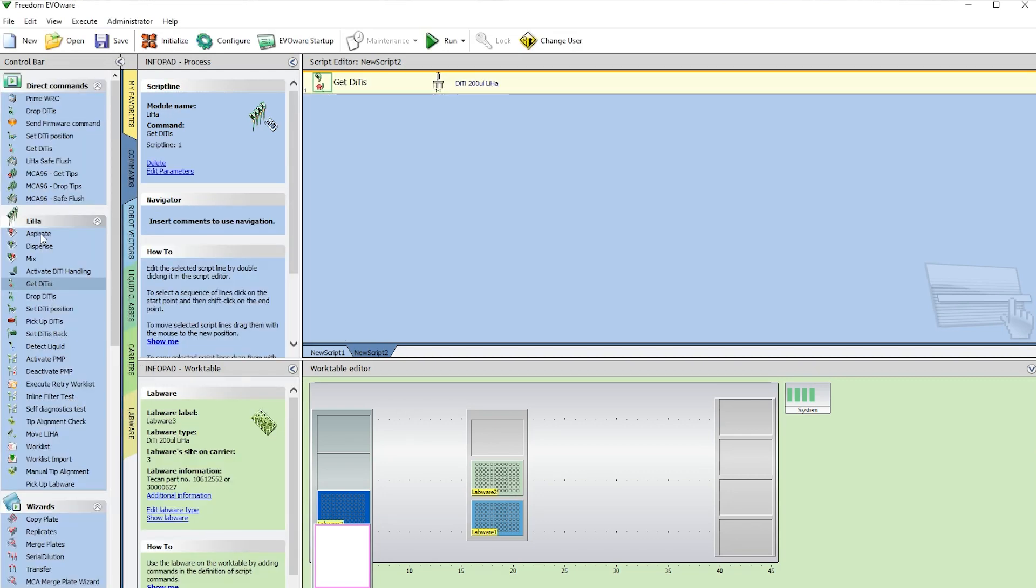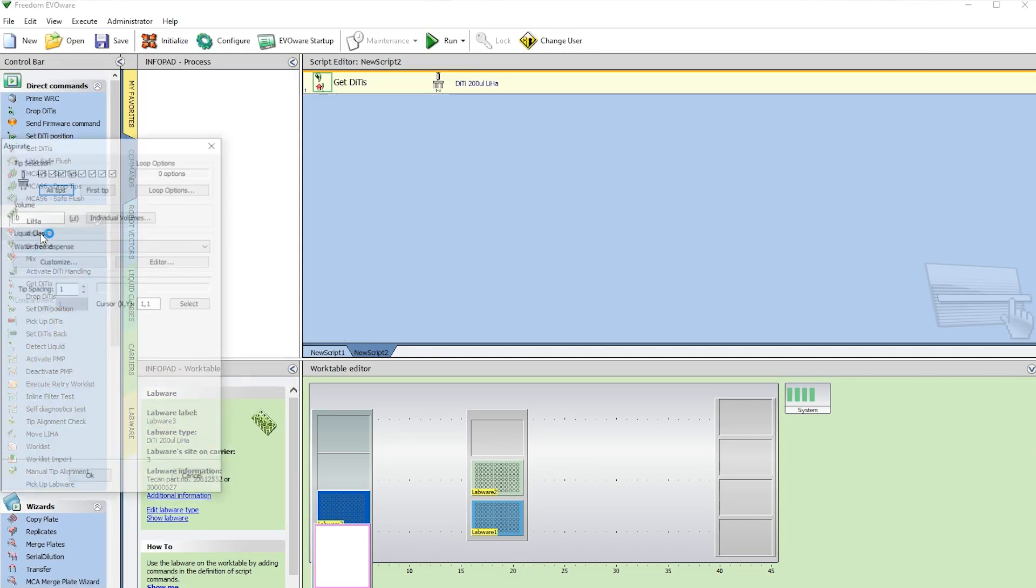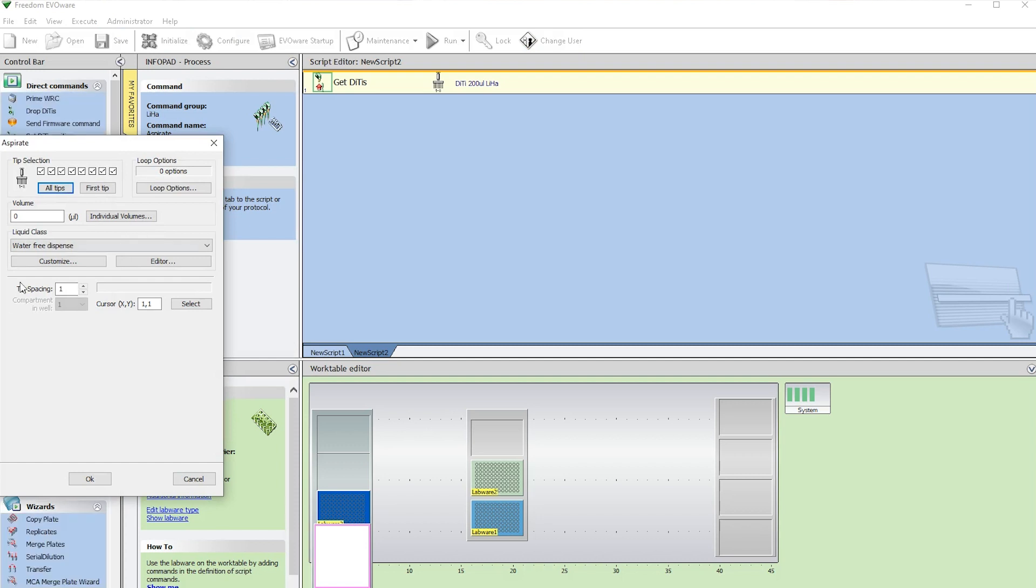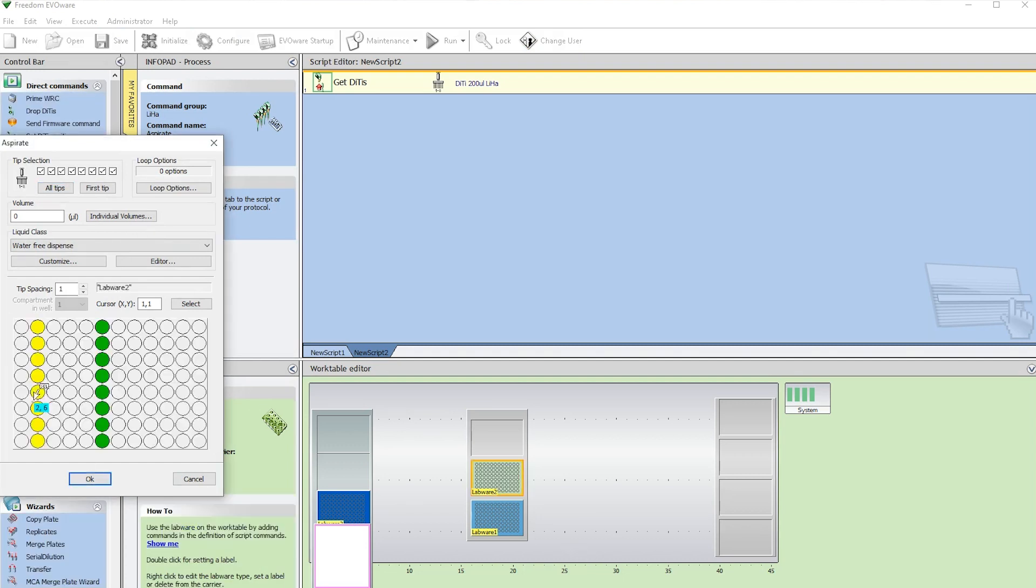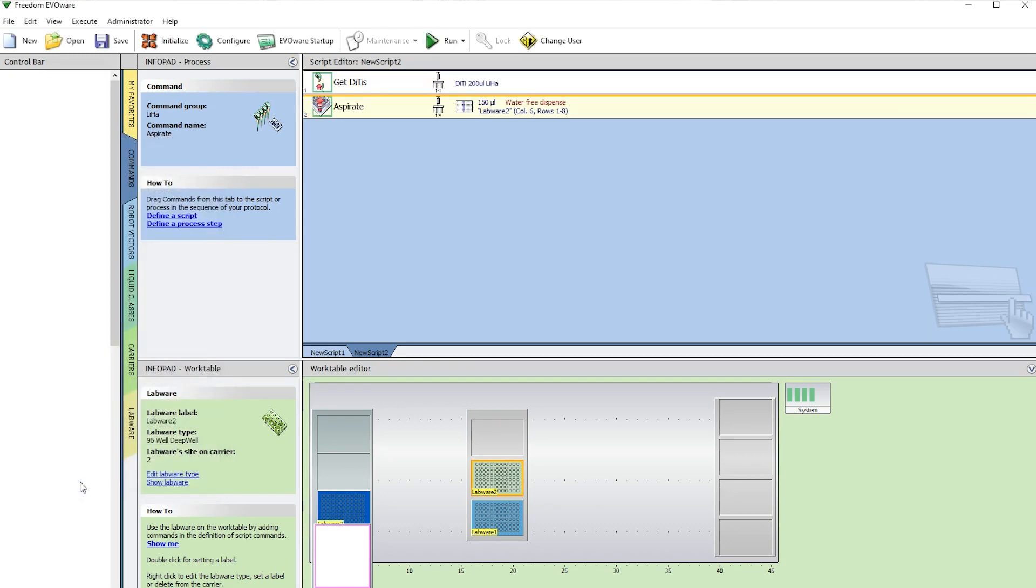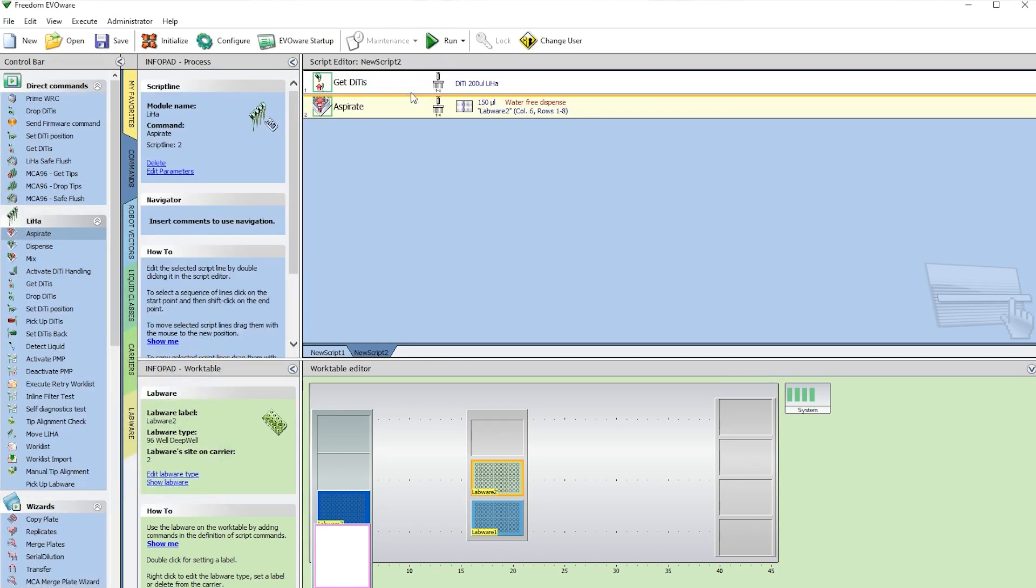The next step we want to add is Aspirate. If you double-click on that, we need to select where we want to aspirate from, which is going to be labware 2. Select the middle. Come up here, give it a volume. We're going to do 150 microliters. Now we have our aspirate step.